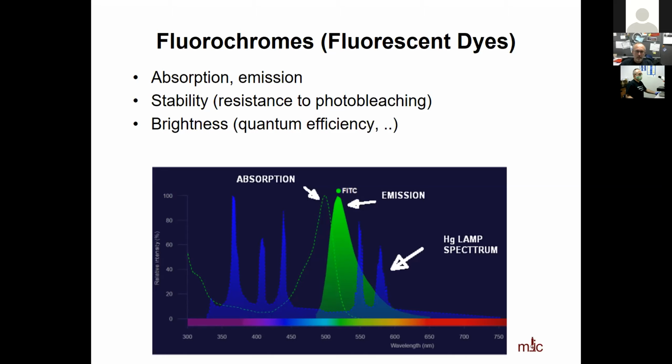And hopefully we'll be able to use something fairly close to the absorption peak so that we have the most efficient excitation. And then of course, we look at the emission peak and try to capture or detect as many of these fluorescent photons as possible.